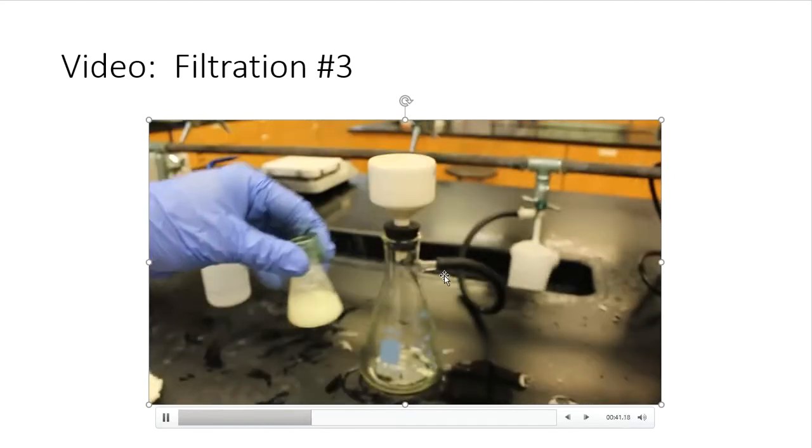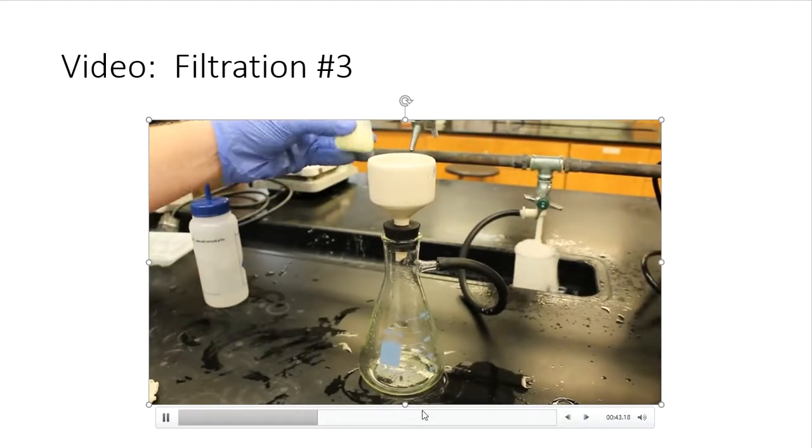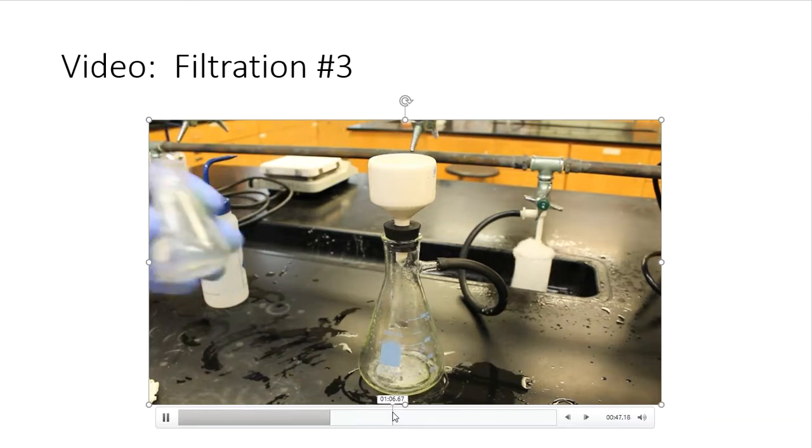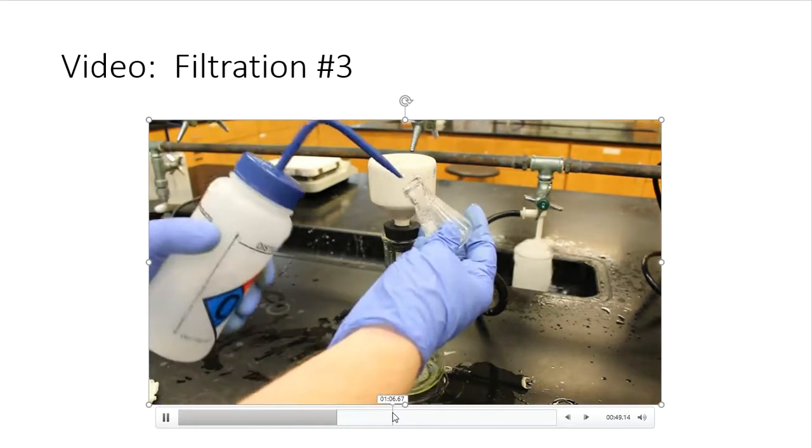And I'm going to swish and dump. And then rinse, rinse, rinse, until I get most of that product out of there.